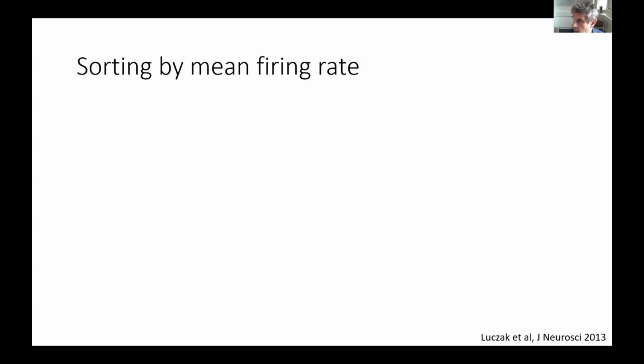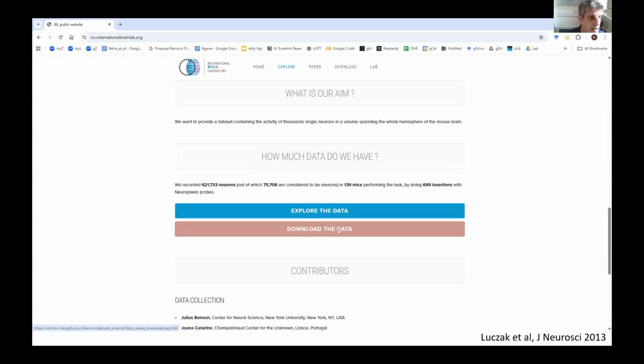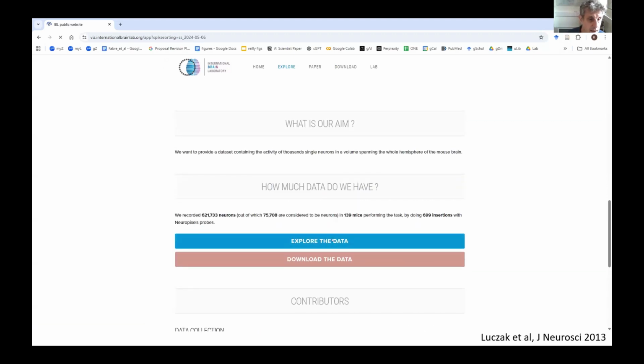and I'm going to try and, well, I won't call it a live demo, but I'm going to try and show you a website. Yeah, here it is, viz.internationalbrainlab.org. This is the visualization site for the International Brain Lab, which have done a huge amount of these sorts of recordings.